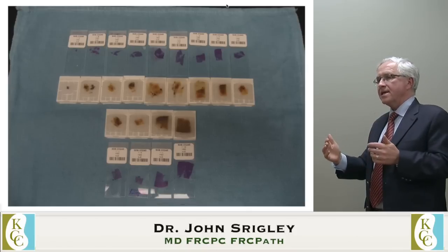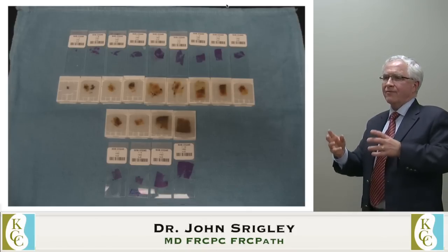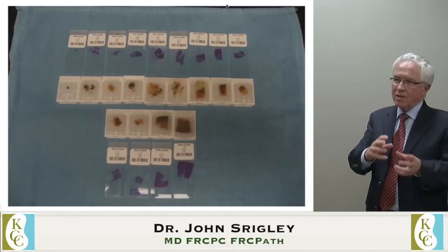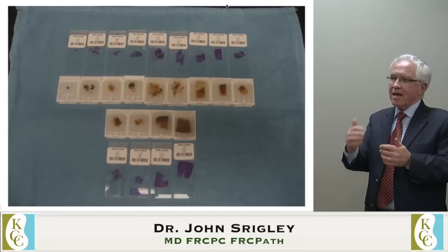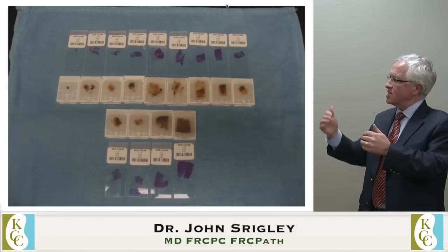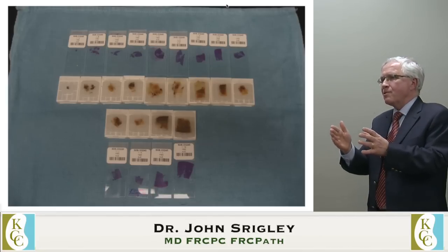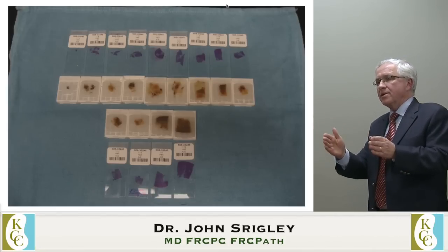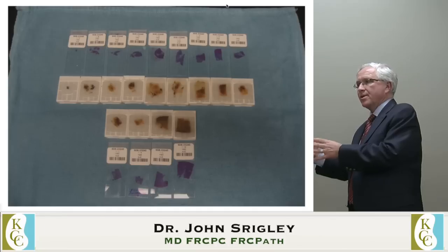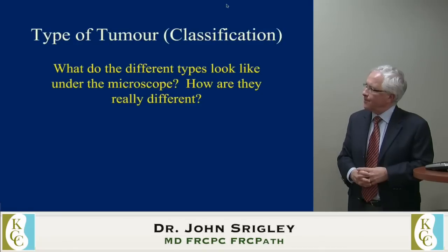So that whole process takes probably a couple of days, because what you usually want to do is you have to fix the tissue for a day, at least one day, and then you have to examine it and cut it into these blocks. The next process is making these blocks and cutting them. So at that point, you're probably about 3 or 4 days out. So that's when the case is usually ready to go to the pathologist for examination. So that's part of the reason why it takes a bit of time.